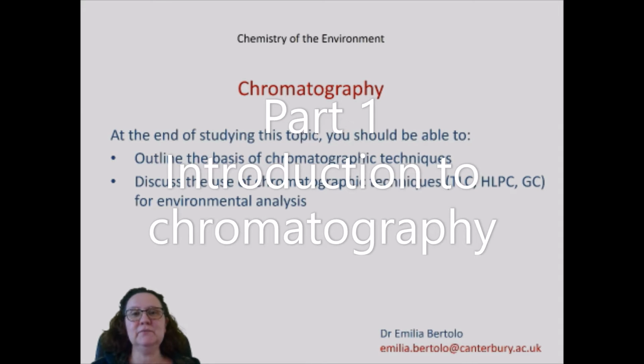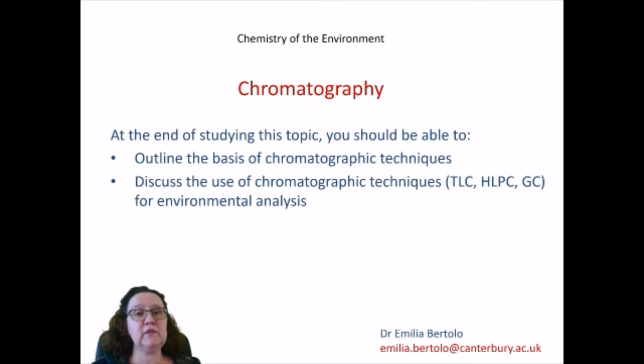Hello everyone! This is the first of a series of videos dedicated to the use of chromatography in the context of environmental measurements. We are going to be looking at the scientific basis of chromatographic techniques, and we'll also be looking specifically at some types of chromatography: thin layer chromatography, TLC, high performance liquid chromatography, HPLC, and gas chromatography, GC, and specifically gas chromatography coupled with a spectrometric technique called mass spectrometry.